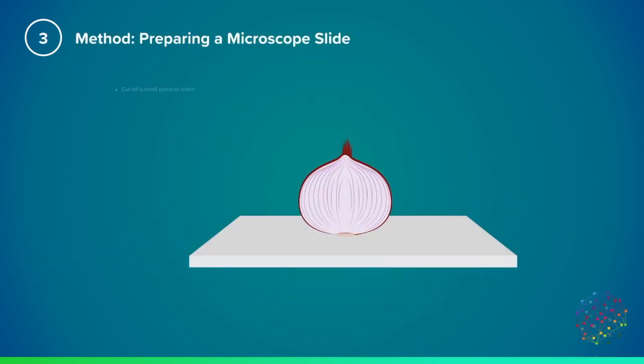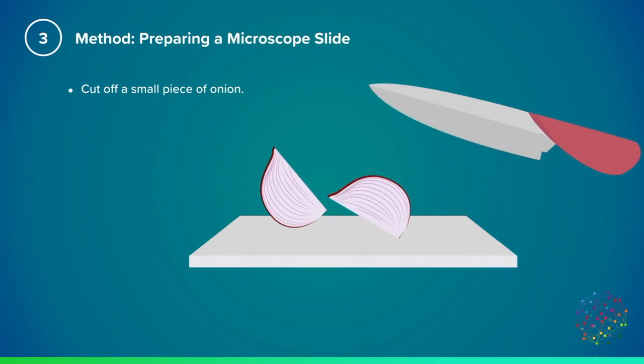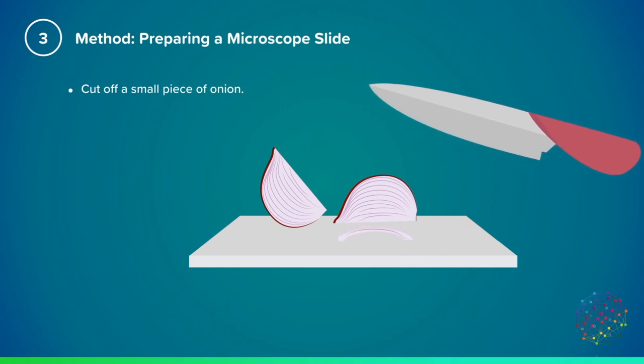To prepare a microscope slide, you first need to take an onion, place it on a white tile and use a knife to cut it into sections. You will only need a small piece of the onion, no wider than the microscope slide itself.